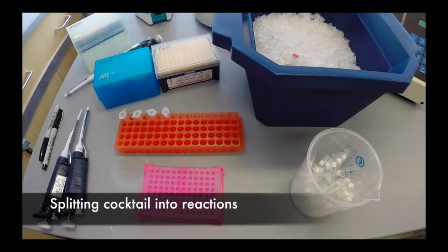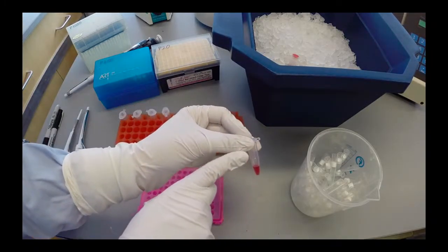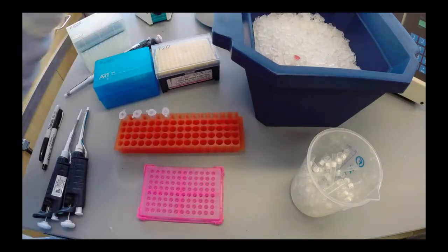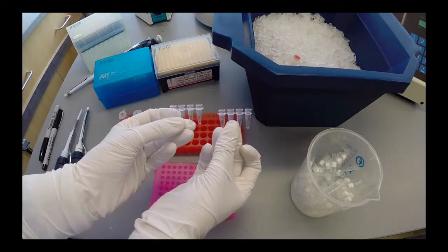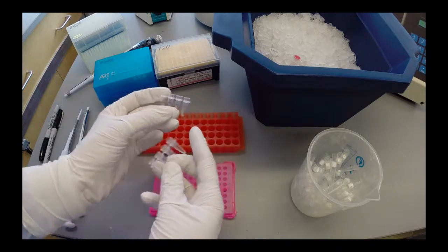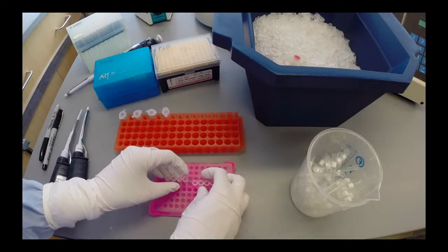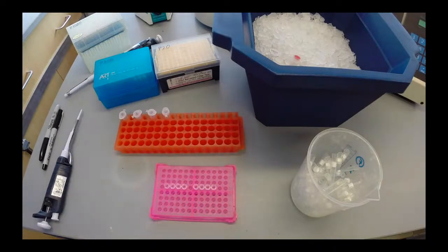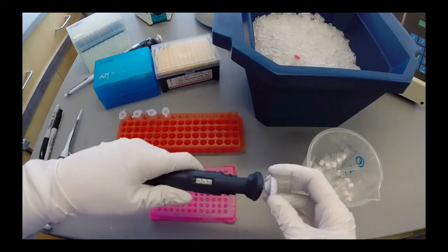The collected cocktail solution will be split amongst the 5 tubes in this example. PCR tubes are provided in strips of 4, so if you need 5 tubes, use 2 strips of tubes. In this case, to amplify actinin 3, 24 microliters of cocktail solution is added to each of the 5 tubes.